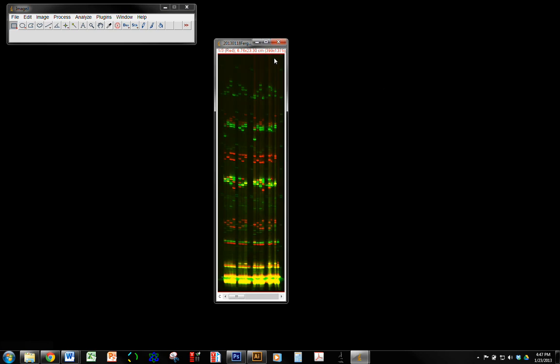You'll know that you've done it correctly if you see this little designation at the top of the image. If you roll your mouse wheel, you can see that you can switch between channels. That's also this slider at the bottom of the image. Click on that, that goes to green, and there's no blue data, but it is possible to have 3 or more channels that would be designated red, green, and blue.